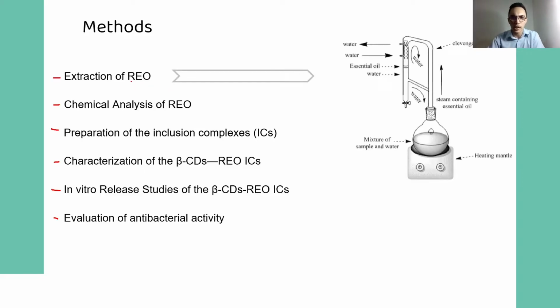In the first step, the authors extracted the rosemary essential oil using a Clevenger apparatus, and with this apparatus they obtained the essential oil.